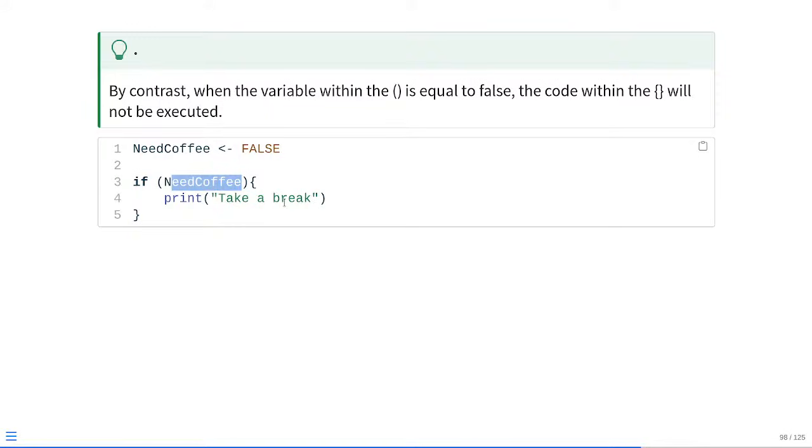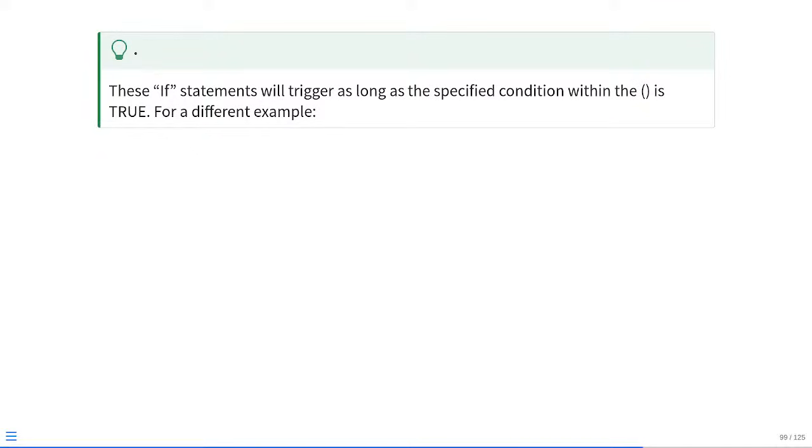And this can be quite useful, especially if you want to work on something that is a raw file. You could set up a conditional statement basically saying, if you identify this as being a raw spectral flow cytometry file, first go ahead and unmix. Versus if you're running a list of files that have already been unmixed, it would just ignore all the steps that happen with the unmixing and just proceed to the very next one. You can think of a lot of different examples as far as when you may want a particular set of lines of code to run, but not in a different context. So these are the options you'd be able to use with a conditional.